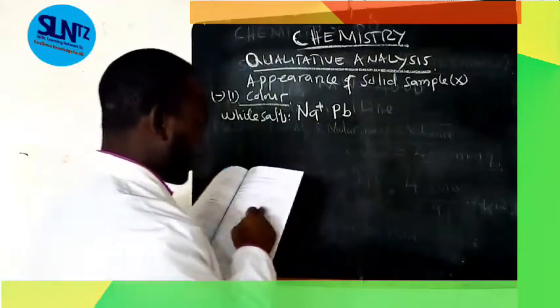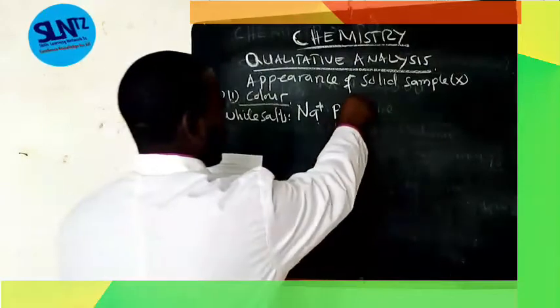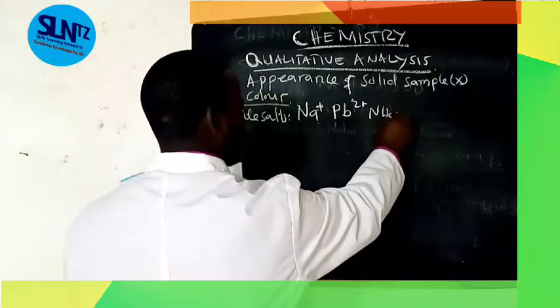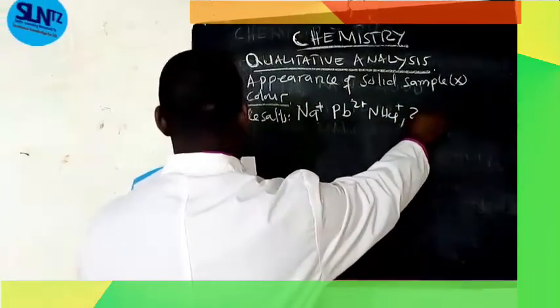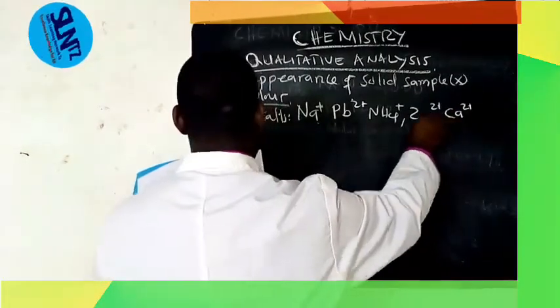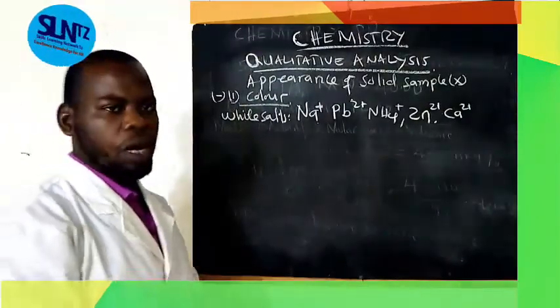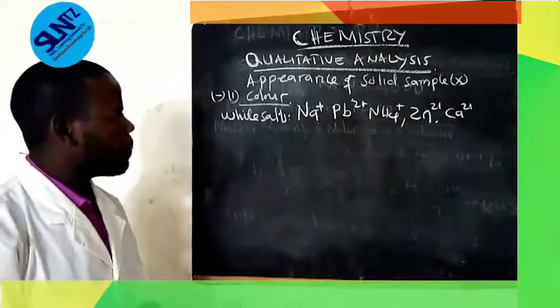It means there is sodium, calcium, lead, the ammonium ion, zinc, and calcium. That is white in O level.